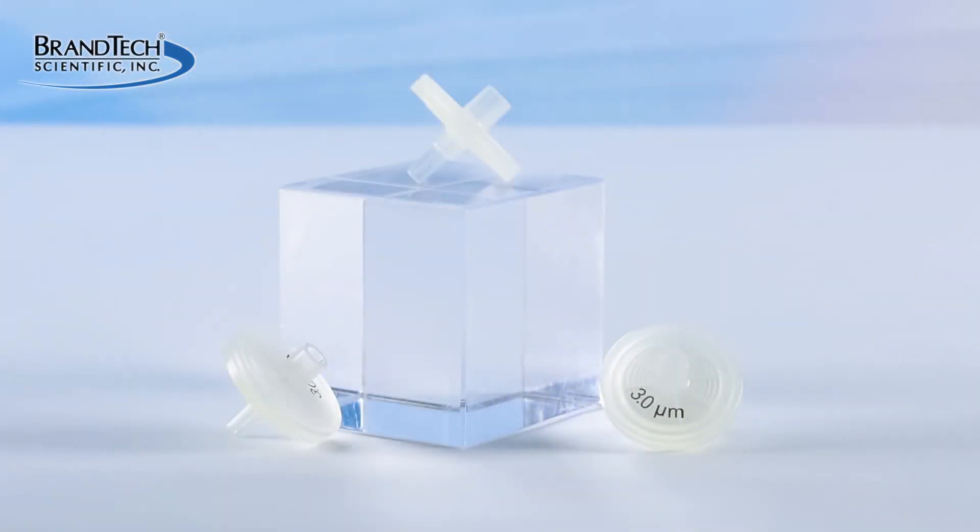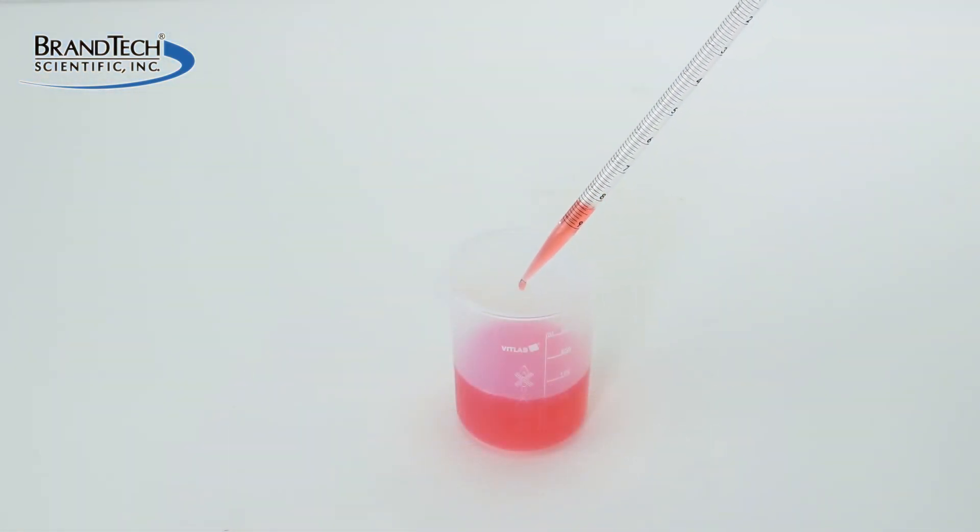Use only ROND 3 Micron filters. The use of other filters may impair performance, not prevent the aspiration of aqueous liquids, and may even damage your Macro.